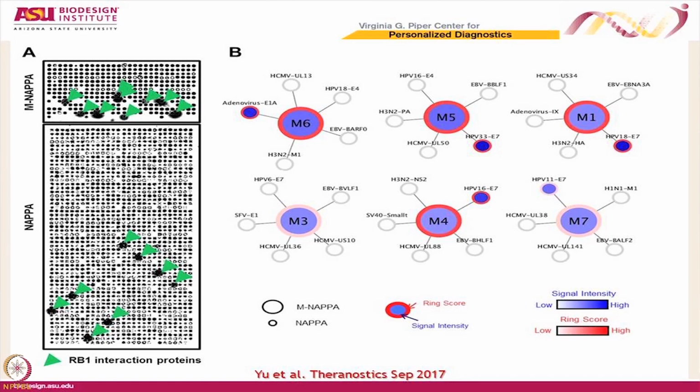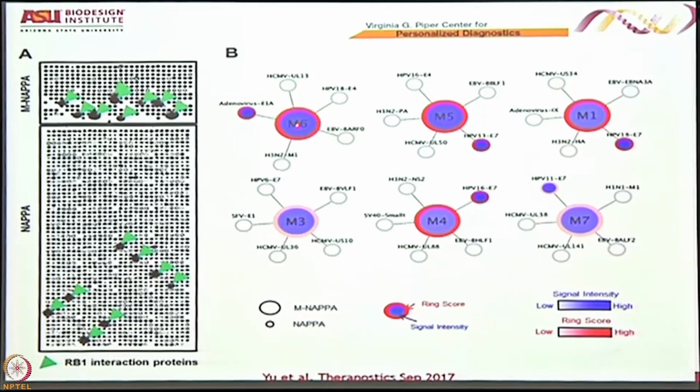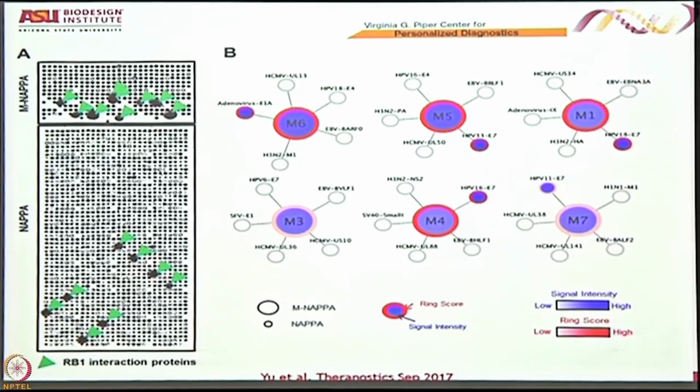So what we ended up deciding to do was this kind of ball and stick model, where this ball is representative of the mixed spot, and each of these individual circles here represents the 5 proteins that are expressed in that spot. The color here means that we detected signal at the mixed spot, and color at any one of these spots means that when we tested the individual spot, it also gave color.